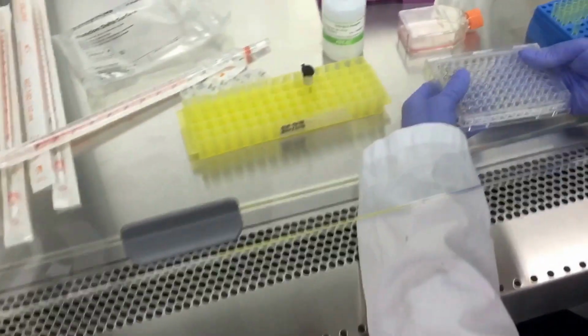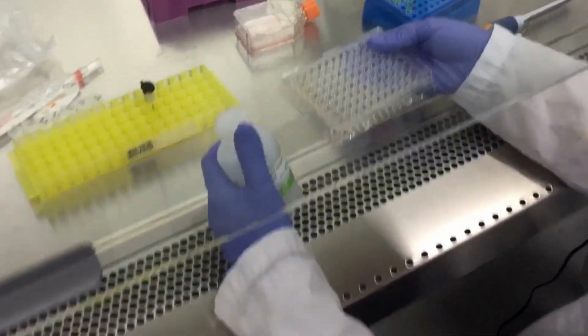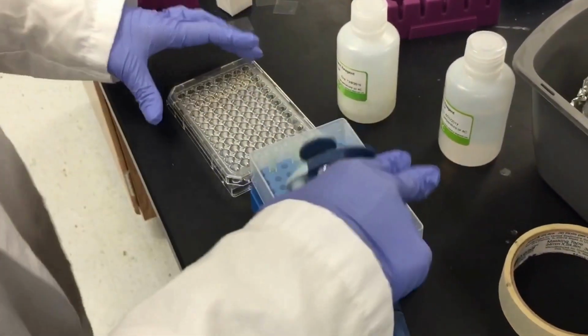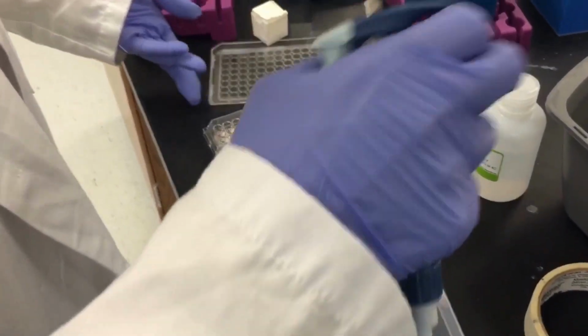And then after 2 hours, you would add in your detergent. You would add 100 microliters of detergent into each well.